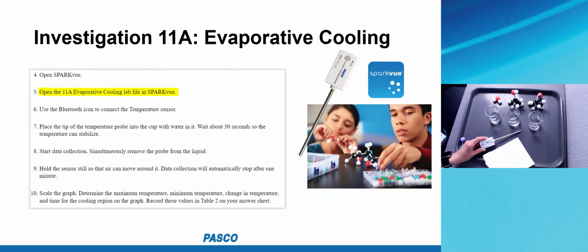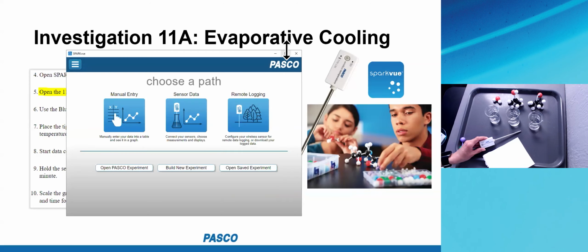So they're going to open SPARKvue, however they open SPARKvue, whatever device they're on. So they open SPARKvue.